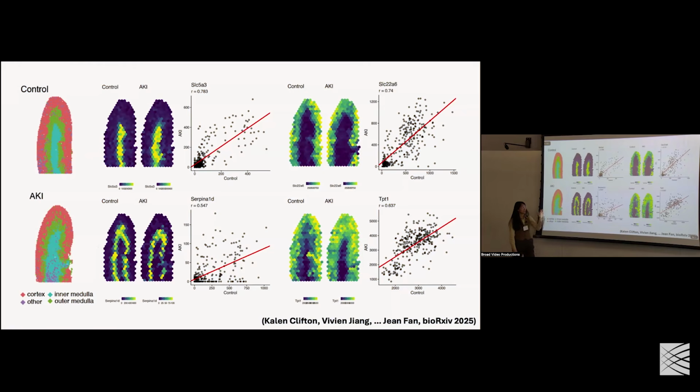And that's what drives the high correlation. And sometimes this is in a compartment-specific manner. Sometimes it's cross-compartmental. Sometimes it's combinations of compartments. But generally, there is still a lot of structural contiguity driven by cell types.